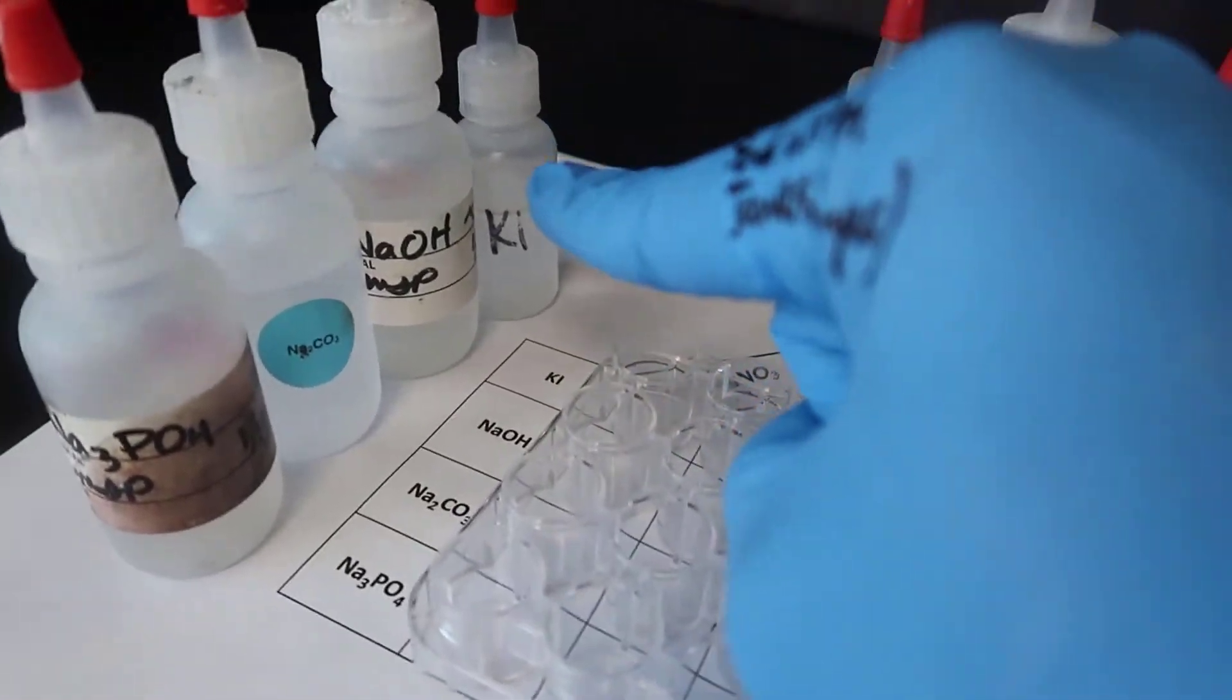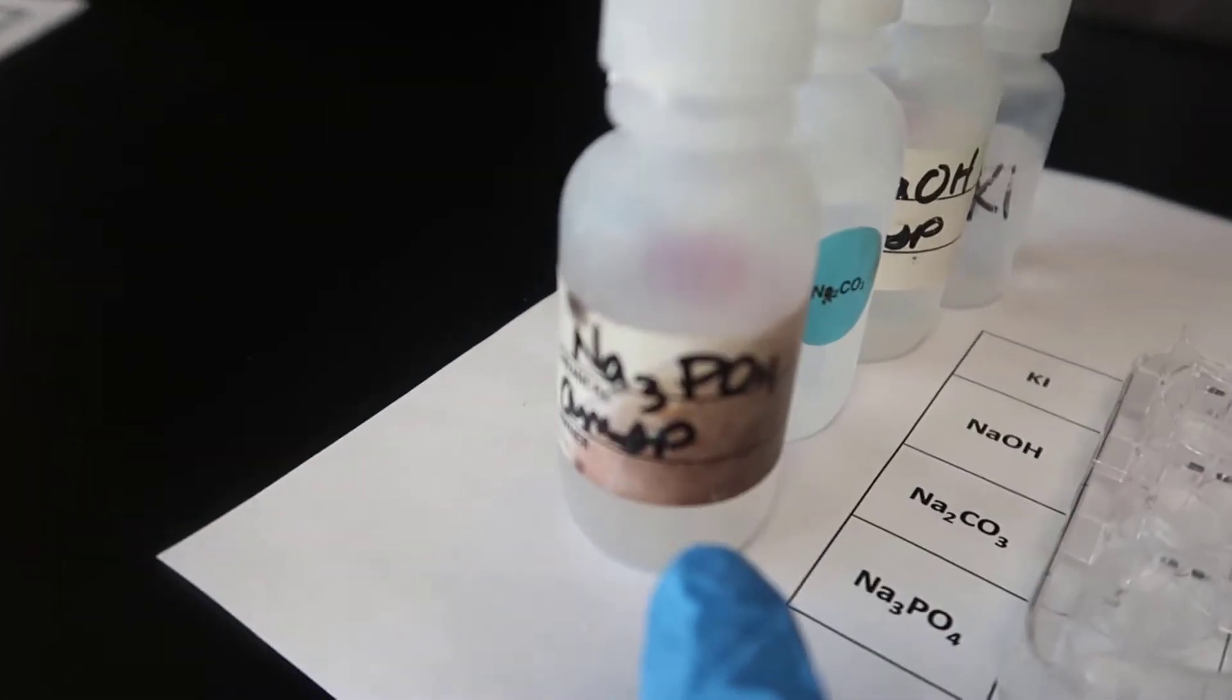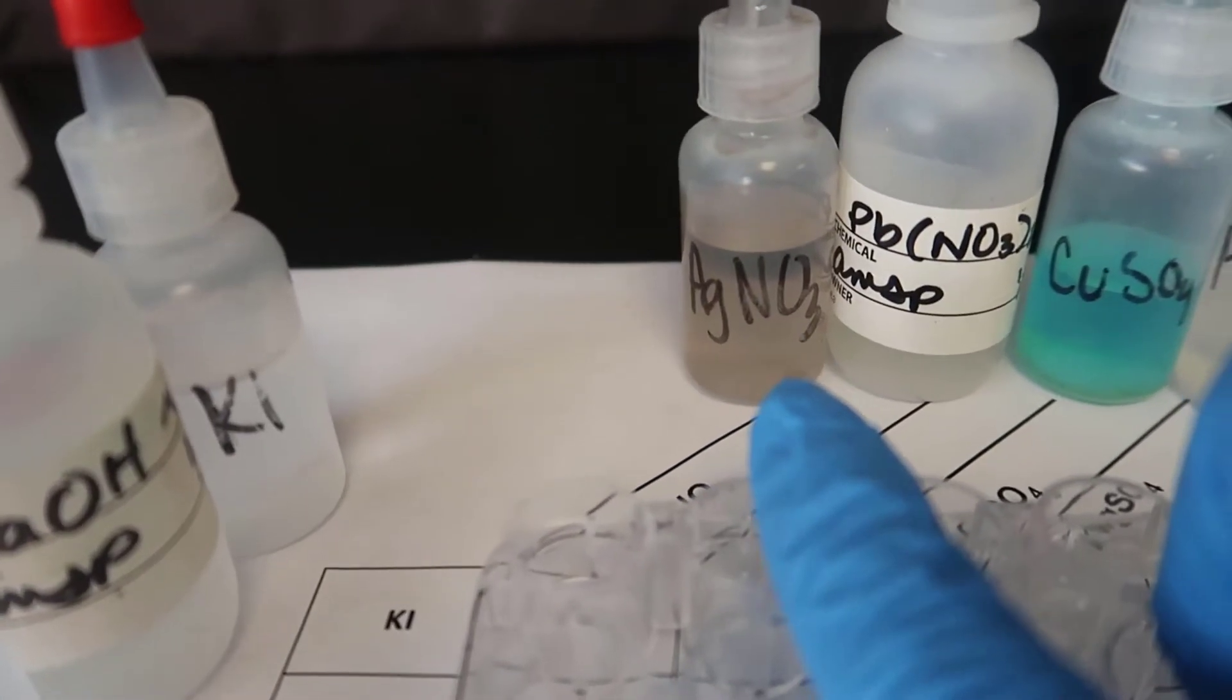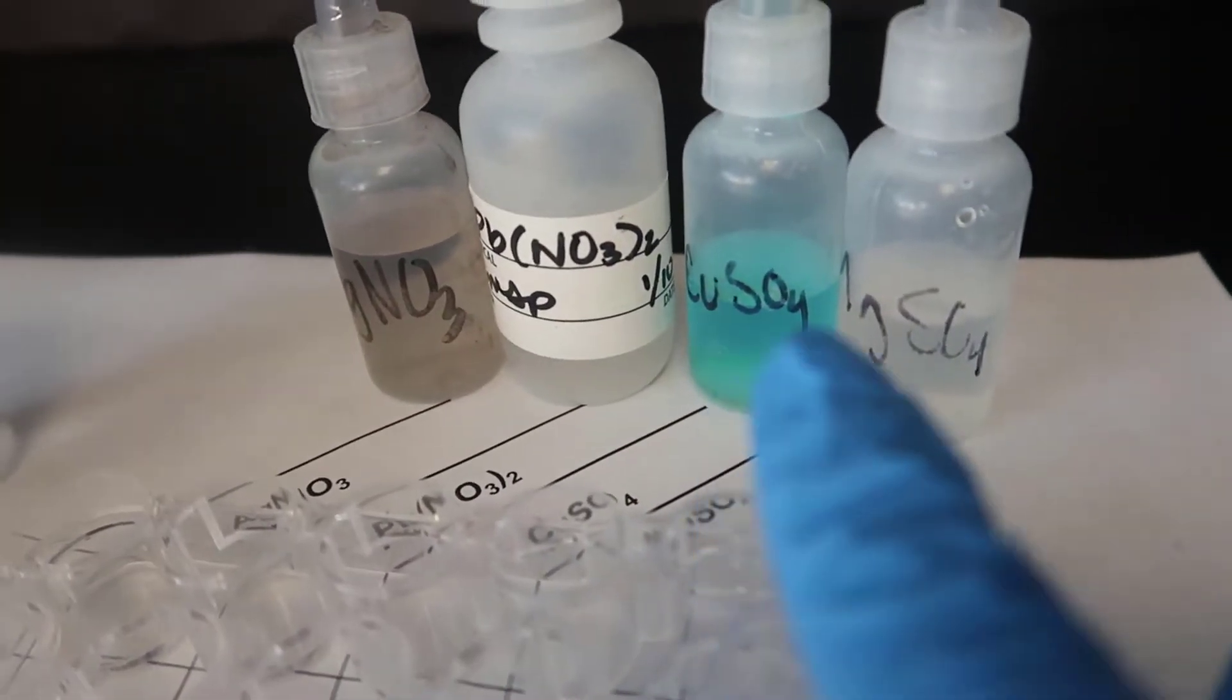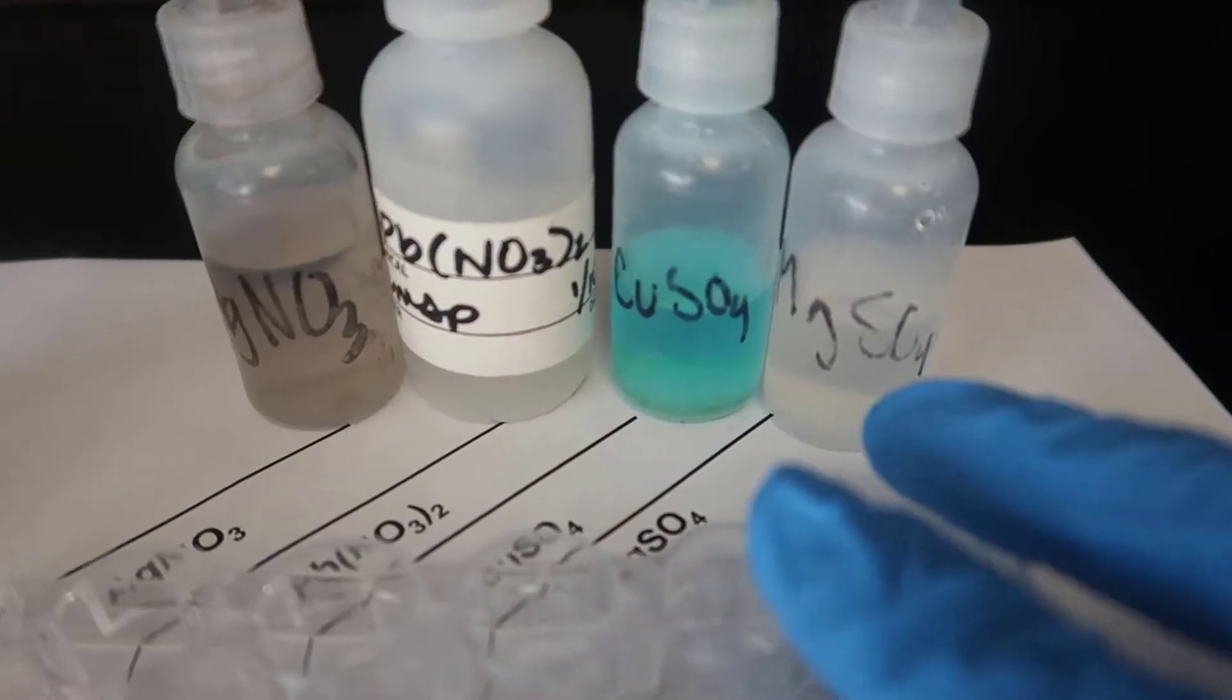So I have KI, NaOH, Na2CO3, Na3PO4, AgNO3, PbNO32, CuSO4, and MgSO4.